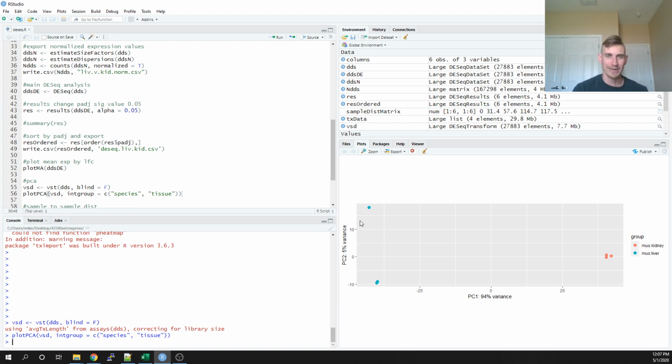Again, these plots are going to look really, really nice because we're working with different tissues. But if we're looking at an experiment where we have treatment groups versus a control, everything may not look so clear all of the time. It's just how our data looks.